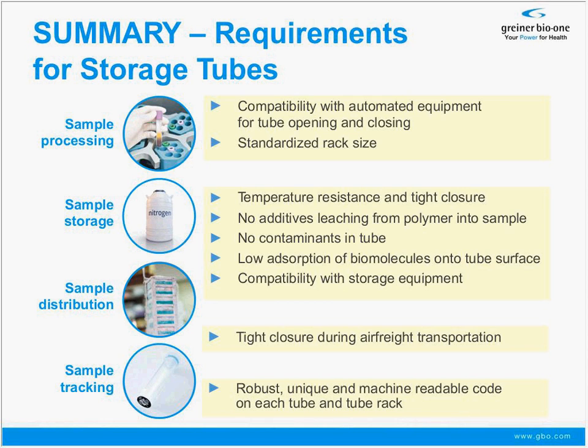During sample storage, there are a few things that can really challenge your storage tubes, amongst them very low temperatures, and also the need to form a tight and good closure and seal so that no water content is lost, leaving your sample tube. There should be as little additive leaching from your polymer into the sample as possible.